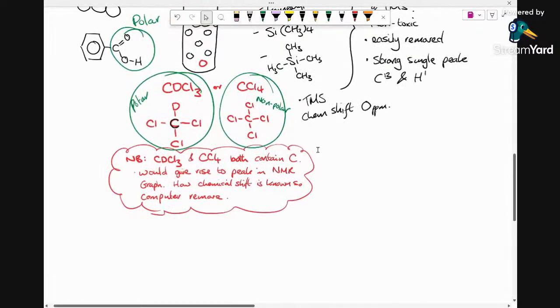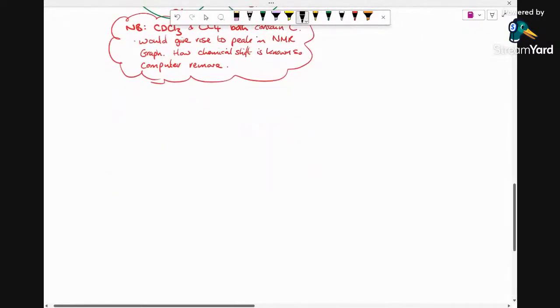Okay, so how does the machine work? Once you've got your sample, we're now entering into this enormous, by the way, the machines are super cool. Number one, they're cooled to very low temperatures, using liquid nitrogen and sometimes even liquid helium.